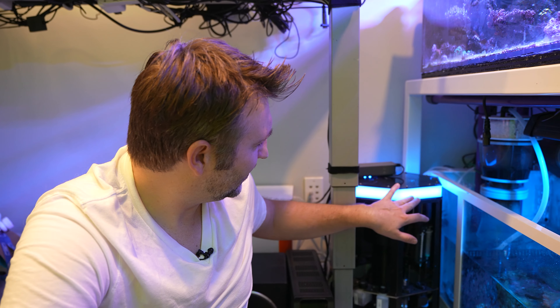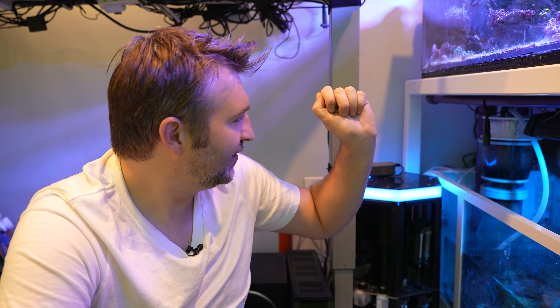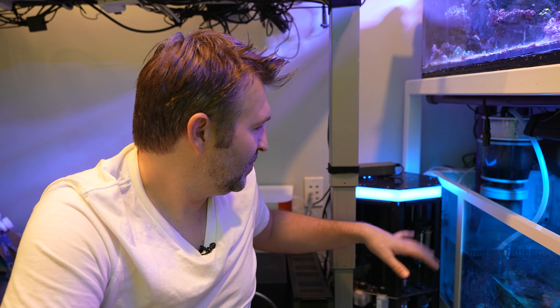One thing to note: the light on it does stay on. You can unplug just the connector off the circuit board if it really bothers you. I did ask them about it and they said they might add an option in a future firmware update to control it. It's nice knowing when it's testing because the color changes, but when it's just on the rest of the time, if you have a fish room you don't care. I see a bit of a blue glow from my office at night, so it would be cool to have more control over that.